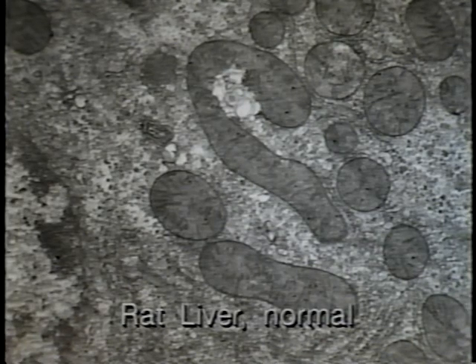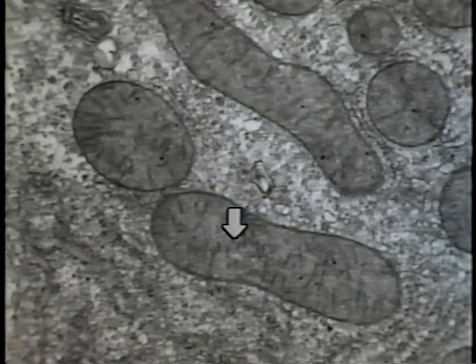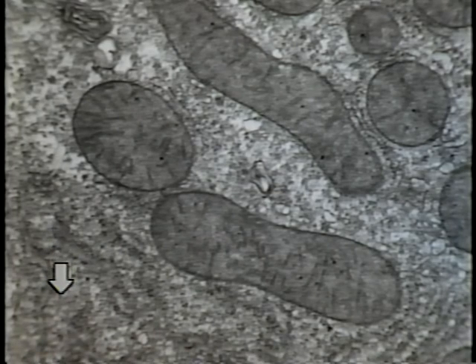The first electron micrograph shows a normal rat liver cell. This large oval structure at the edge of the picture is the nucleus with a normal chromatin pattern. These smaller, round to ovoid structures are mitochondria. You should take note of the appearance of normal internal membranes, or cristae. These groups of parallel membranes are the rough endoplasmic reticulum. Between these cellular organelles, the cytoplasmic matrix can be seen. These small dark clusters are normal deposits of glycogen.